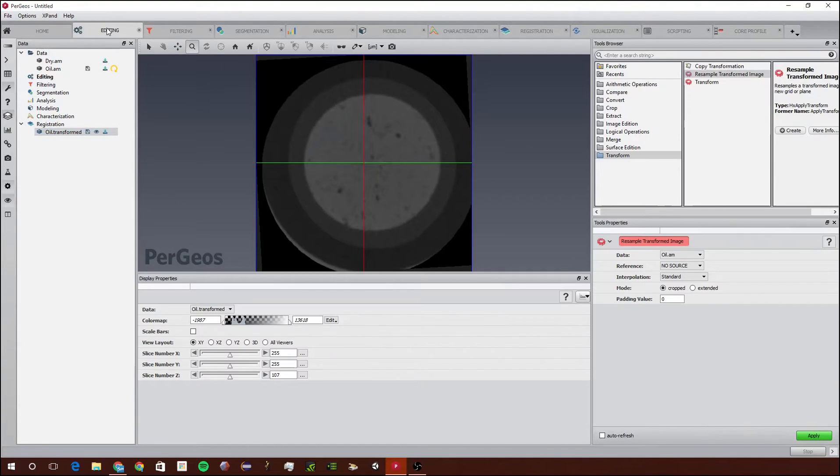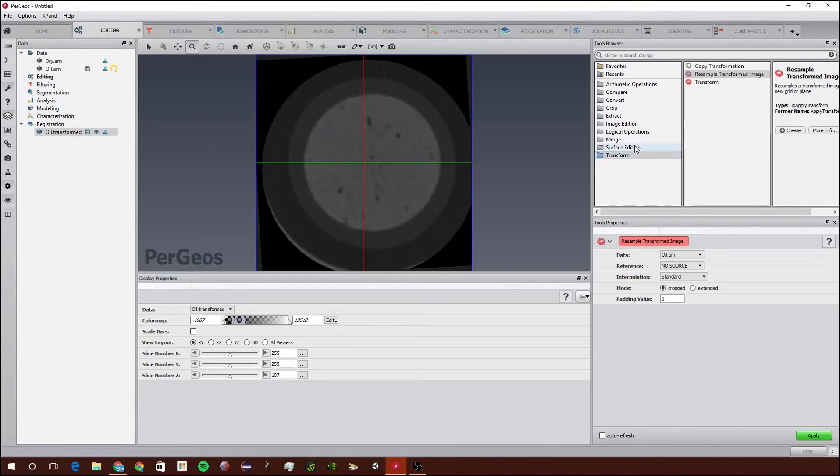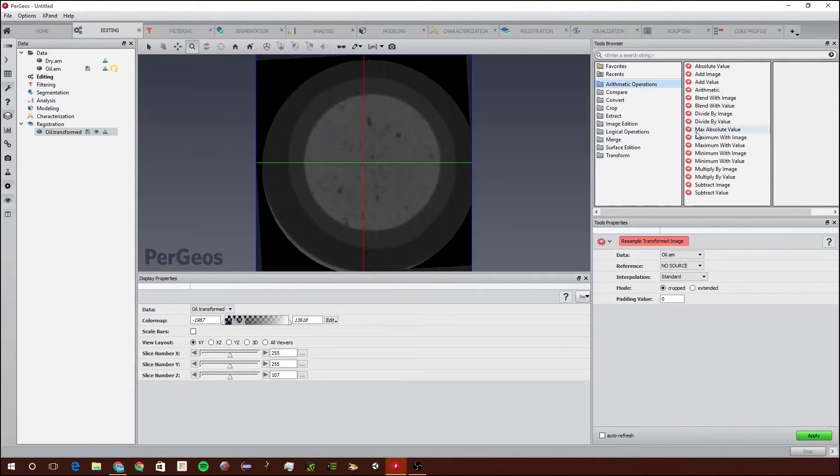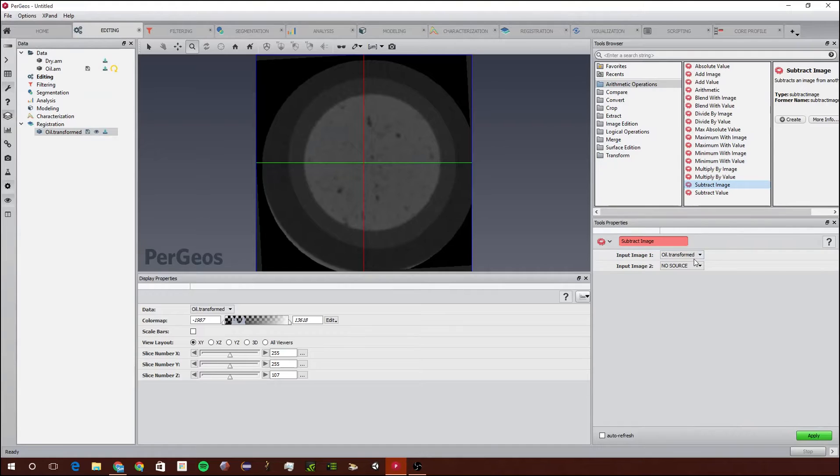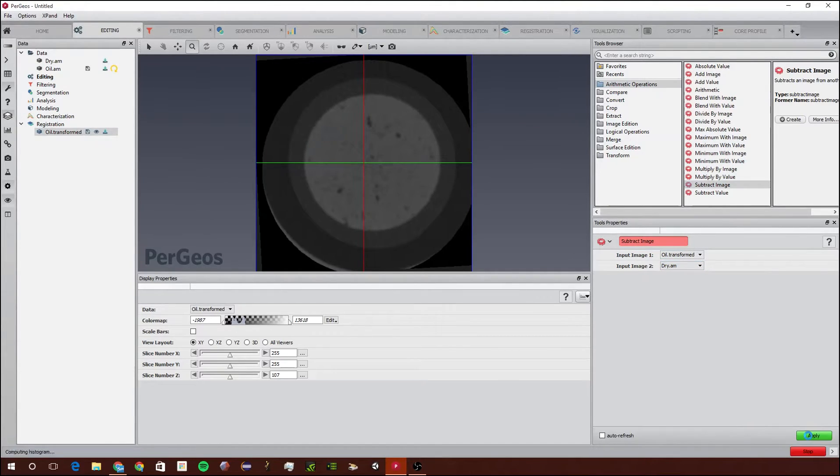Next we're going to go into Editing Workspace. The next part of this tutorial is how to visualize the differences in these images. To start out, we're going to go to Arithmetic Operations and Subtract Image, and double click on that. We're going to do oil dot transformed minus dry dot am, and click Apply.